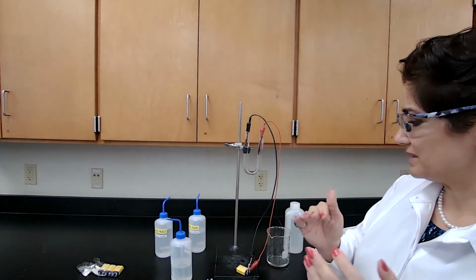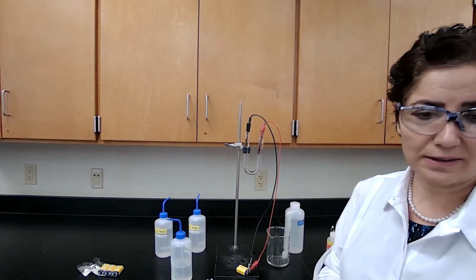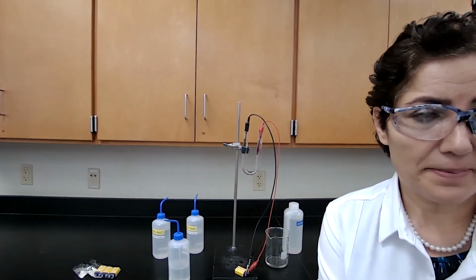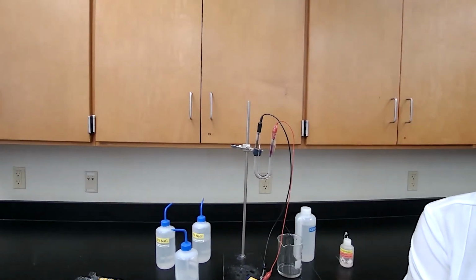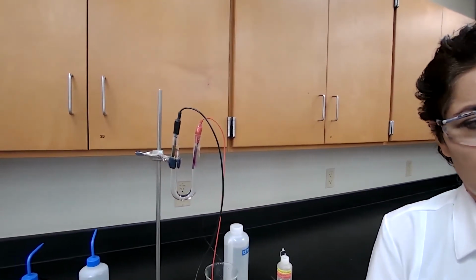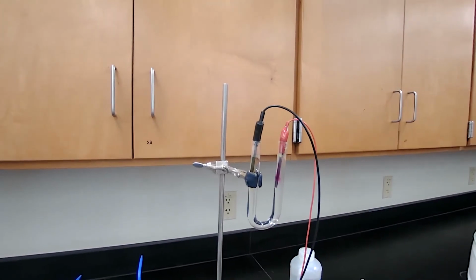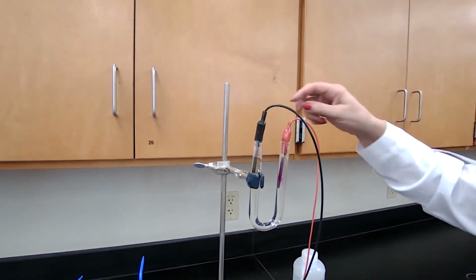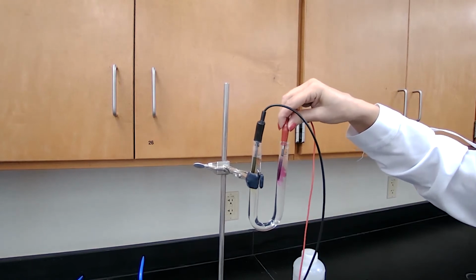I'm going to bring this closer, and we can see the close-up. Right here, you can see it in action, closer. See the pink color appeared on the cathode side.